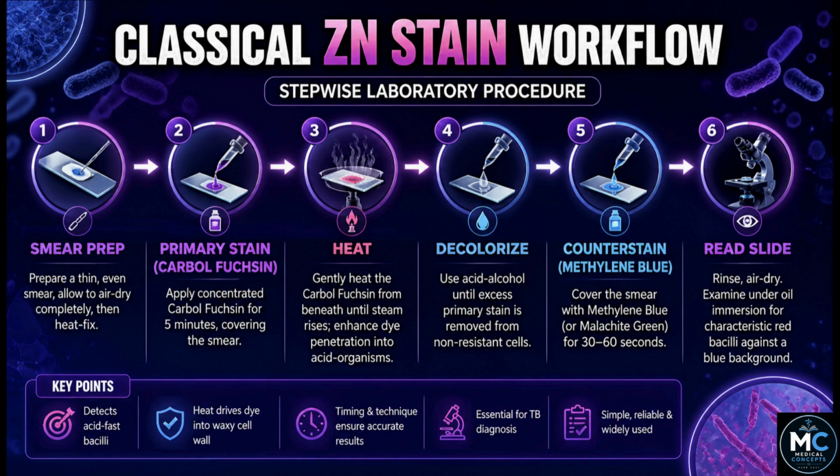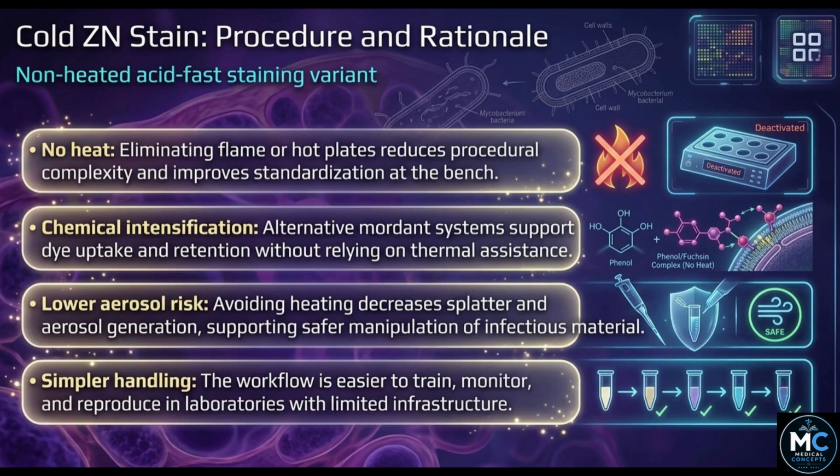Cold ZN stain. Procedure and rationale. Cold Ziehl-Neelsen methods remove the heating stage, trading thermal enhancement for safer and simpler bench execution. No heat. Eliminating flame or hot plates reduces procedural complexity and improves standardization at the bench. Chemical intensification. Alternative mordant systems support dye uptake and retention without relying on thermal assistance. Lower aerosol risk. Avoiding heating decreases splatter and aerosol generation, supporting safer manipulation of infectious material. Simpler handling. The workflow is easier to train, monitor, and reproduce in laboratories with limited infrastructure.